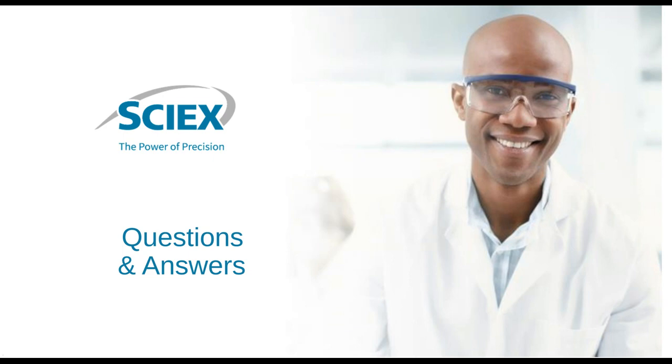We haven't really tested that, have we? I'm just trying to think. We always use the dye in excess, and we tend to use the same protocol every time. We've used it for several different applications now. I know you can dial it down and decrease the concentration, but typically it's only 50 to 100 times the protein concentration, I would have thought, off the top of my head. Does that make sense? Yeah, I think so. We use an excess of it because there's always a peak that comes off first of the unused dye. So yeah. Thank you very much.